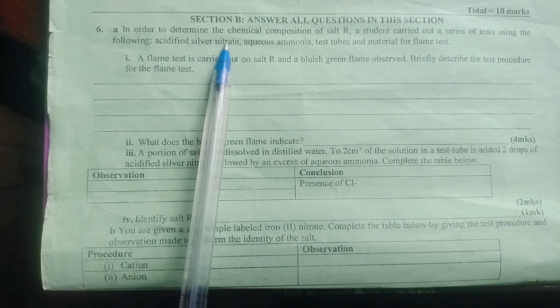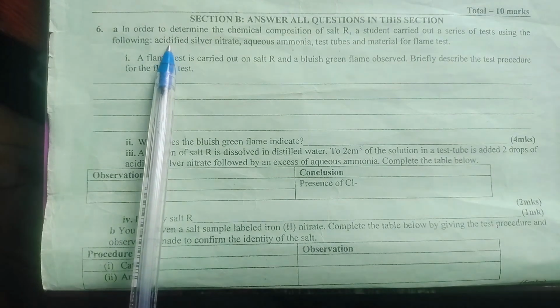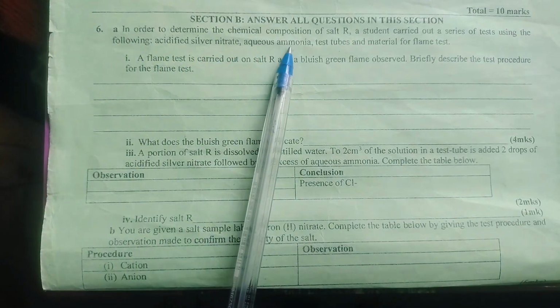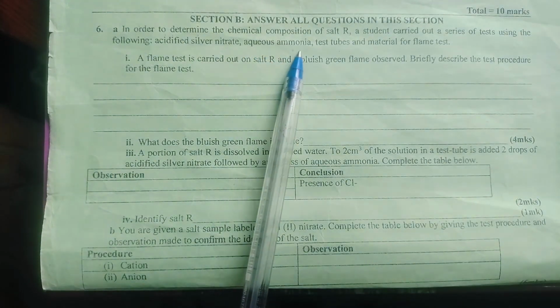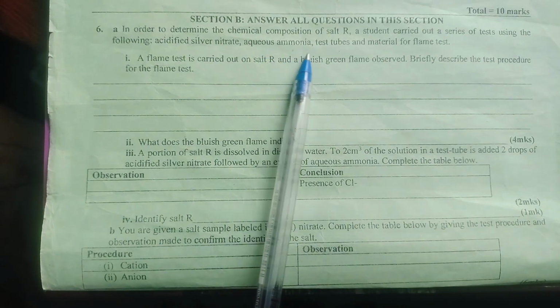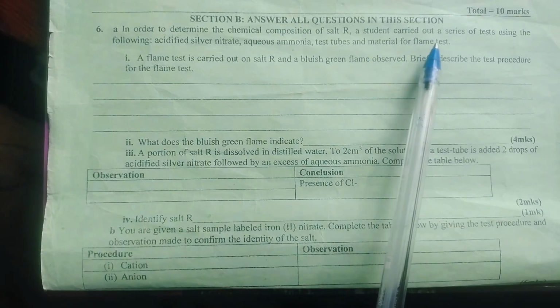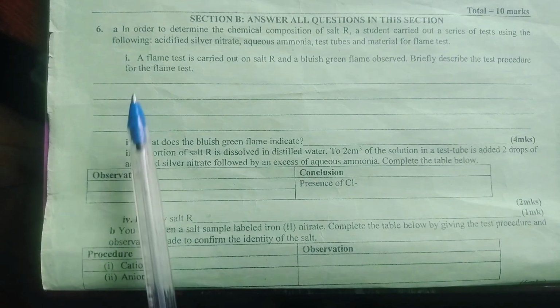When you see acidified silver nitrate, you just know that they are testing for the halide ion: the chloride, the bromide, or the iodide. Aqueous ammonia. When you see aqueous ammonia, what should come to your mind? They are either testing for iron 2 plus or iron 3 plus. All the reactions take place in the test tube. And we have materials for flame test.